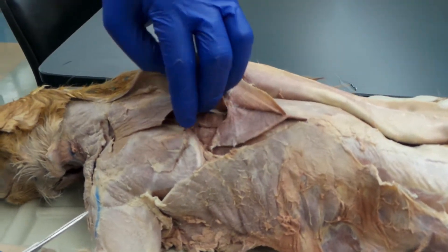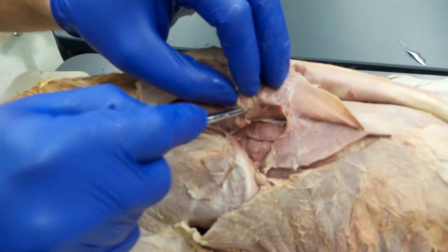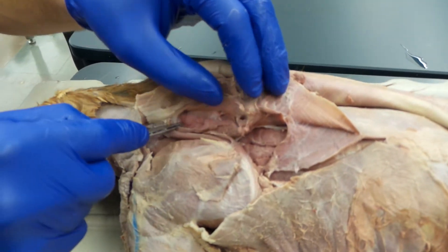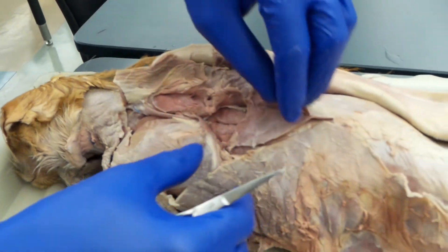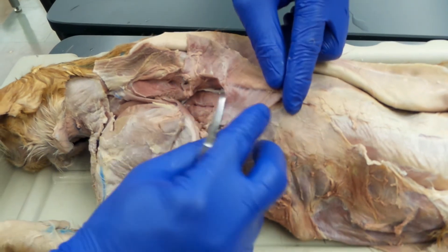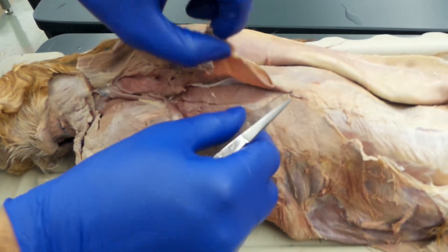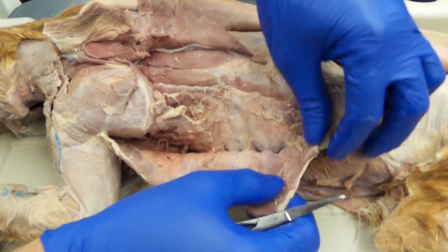Now, if we lift the spinotrapezius and the acromiotrapezius, we can take a look at some of these deeper muscles of the back. When you lift that spinotrapezius, almost immediately you see this very large muscle — this is part of the latissimus dorsi. It's been cut and kind of pulled back.